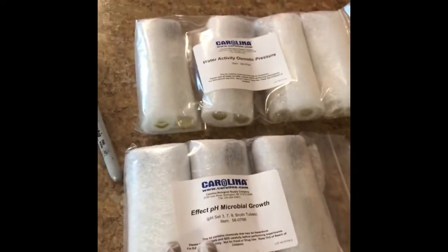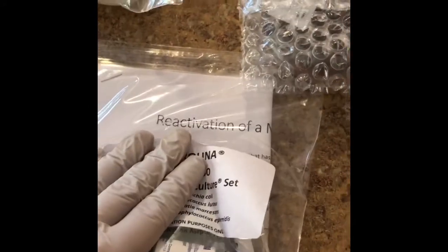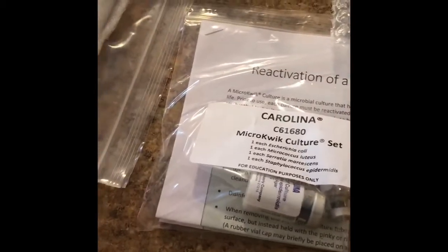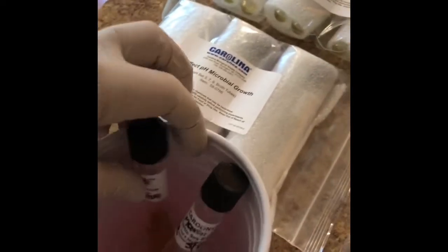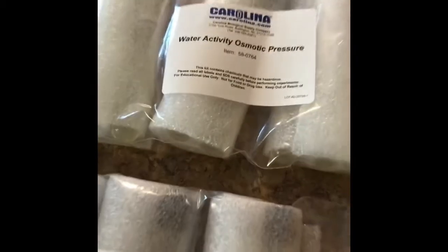I have to rehydrate my lyophilized cultures, which are right here. So far I have already rehydrated Micrococcus luteus and Serratia marcescens, and I've been holding on to the inoculated broths in the refrigerator inside of a secondary container. So I'm going to hold on to those until Sunday when I inoculate all this media, right?